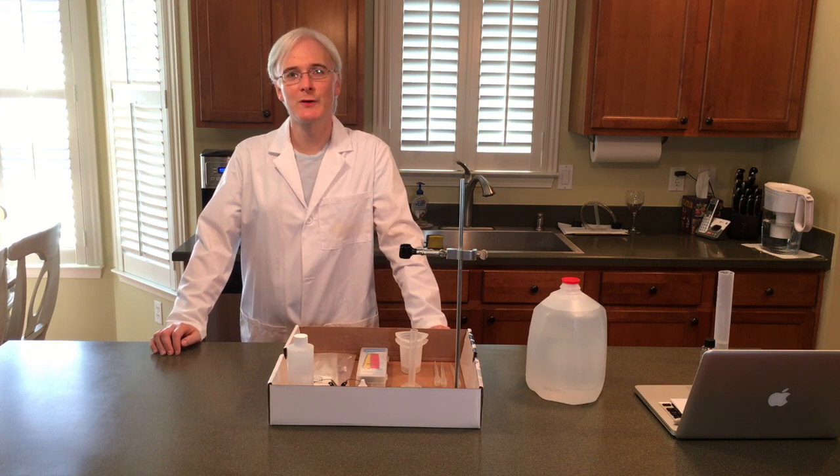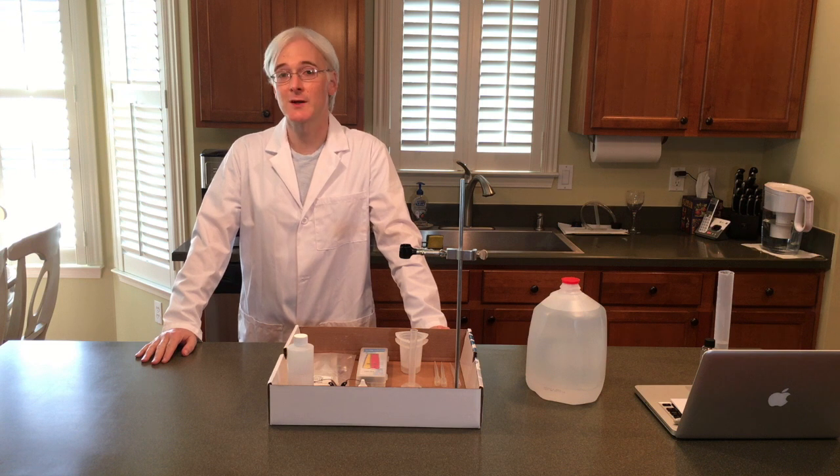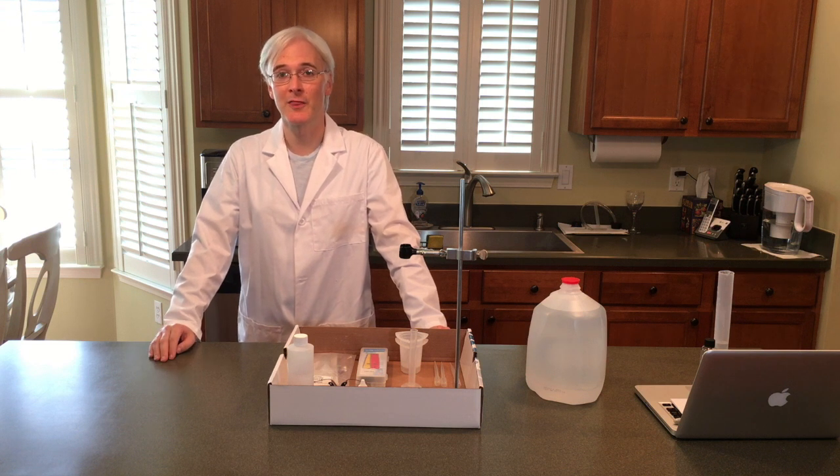Hello, it's Fran. Today we're going to work on equilibrium constants, but before we get started on this we have one little thing to do.